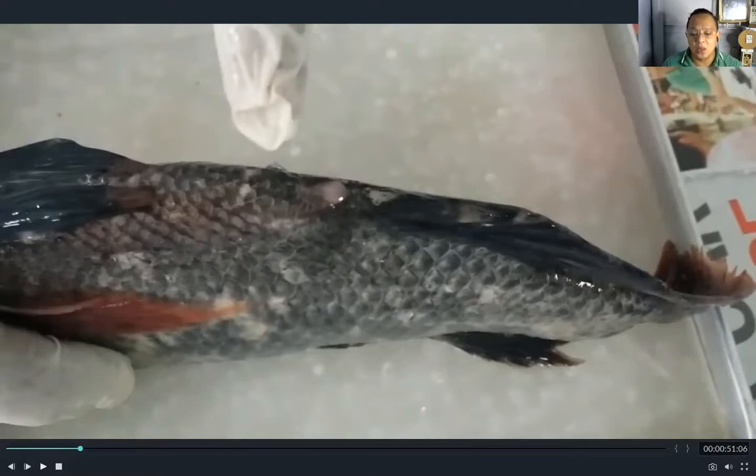The dorsal fin lends stability in swimming. The pelvic fin is also used for stability in swimming. The caudal or tail fin is the main propelling fin. The anal fin also lends stability in swimming. And the pectoral fins are for locomotion and side-to-side movement of the fish.